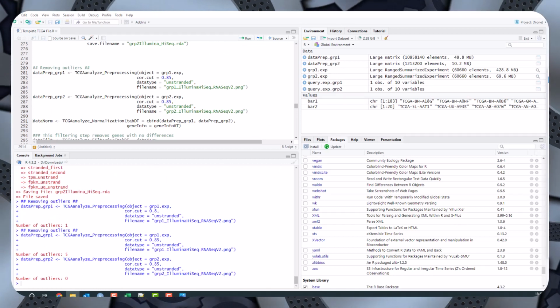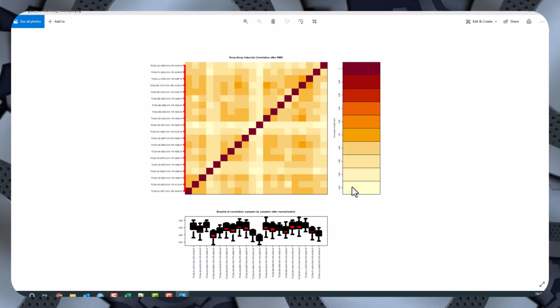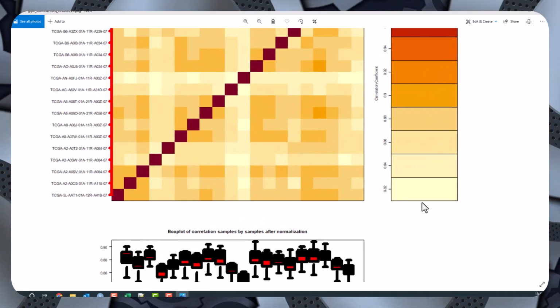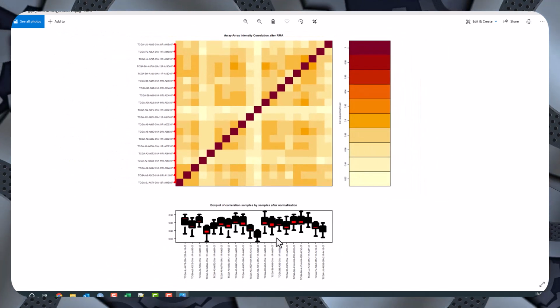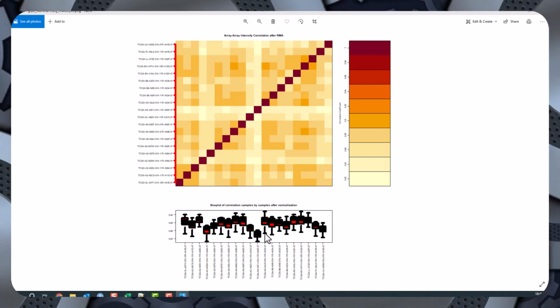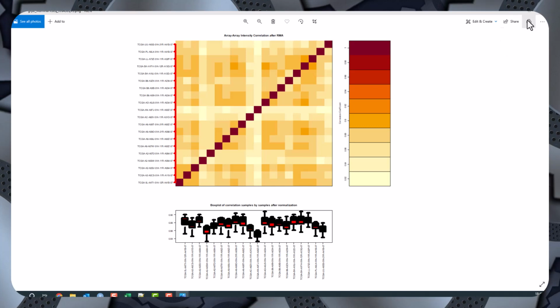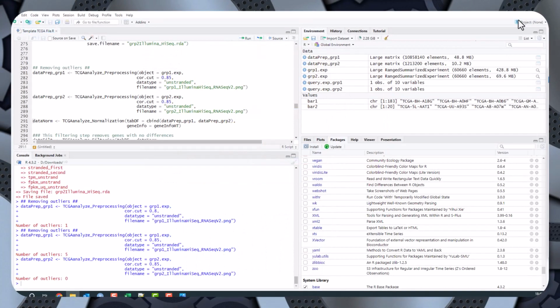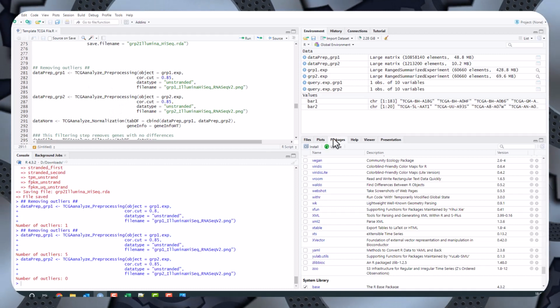If I look at the stage 2 data, you can see that they're all very similar to one another. There's none that are drastically different. There's a lot of bouncing up and down in differences in the strength of the signal for the different data sets, but that will be coped with a process called normalization, which is the thing that happens next.